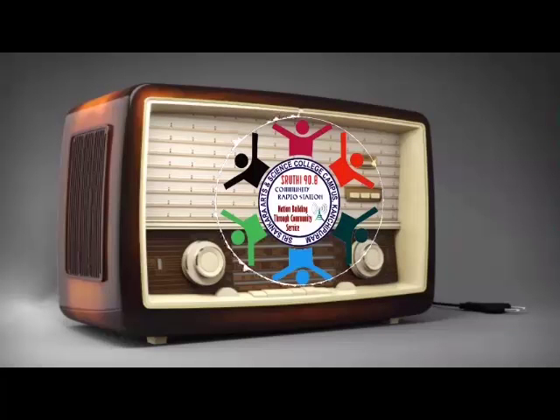In the aerobic bioreactor, the reaction is carried out in the presence of oxygen. In case of anaerobic bioreactor, the reaction is carried out in the absence of oxygen and the presence of carbon dioxide. In the third type, solid state, the name is enough: the reaction is performed in solid state instead of liquid medium. The fourth one, immobilized type. In this type, the microorganisms involved in the bioreactor are immobilized with some other particle. These are the common classifications of bioreactor based on many parameters.